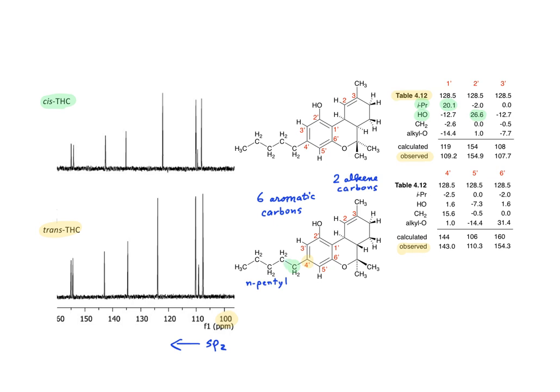And the closest thing that fits in table 4.12 is the ethyl group, and I just use CH2 as the abbreviation, and at 4' it has the biggest effect. 5' is substituted with a hydrogen, and then at 6' we're substituting with an ether alkoxide, and that accounts for this correction factor.